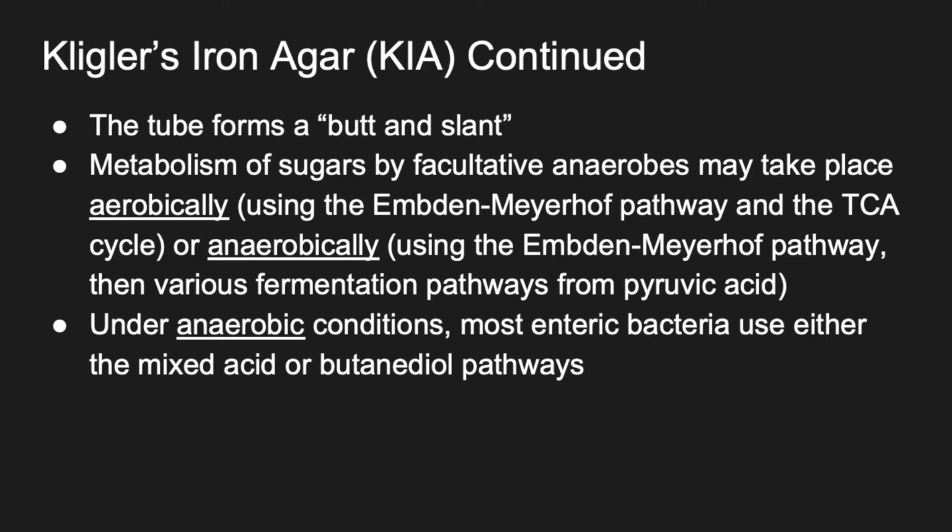Under anaerobic conditions, most enteric bacteria use either the mixed acid or butanediol pathways. We've already talked about these in the last lecture. If you need a refresher, feel free to go back to Lab 16. I talk a little bit more about the mixed acid fermentation pathway and also the 2,3-butanediol pathway.